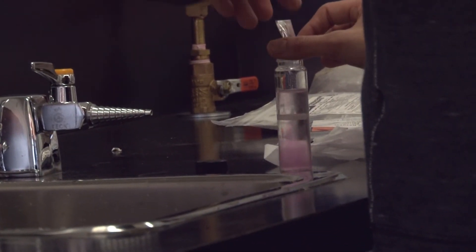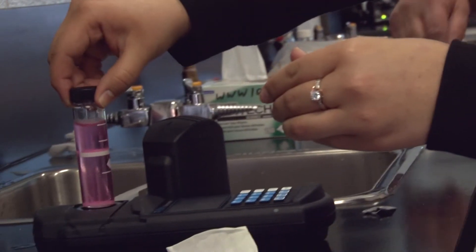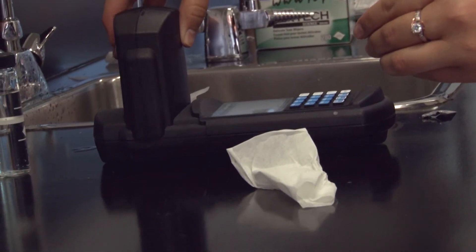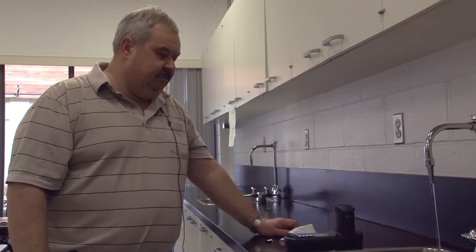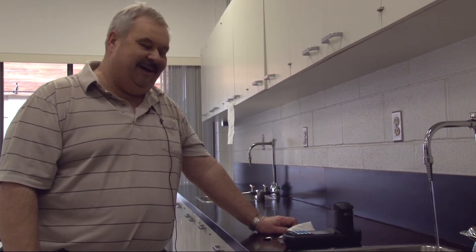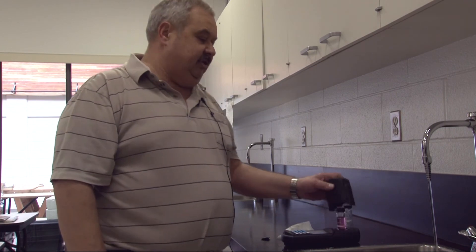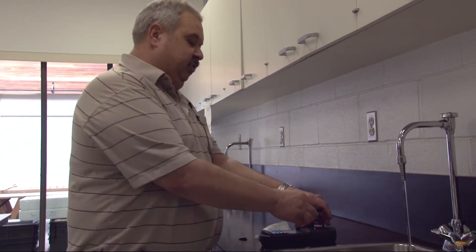If there's chlorine present, you will see a color change. You have one minute to do this test — insert it back in the machine and press read. The reading is 0.98 milligrams per liter, which is the amount of chlorine in the system and is usually acceptable for most systems.